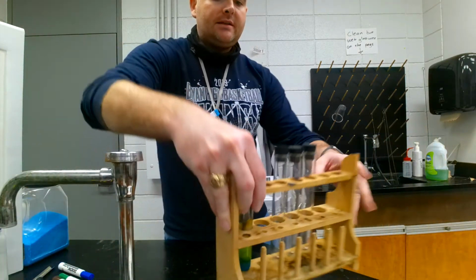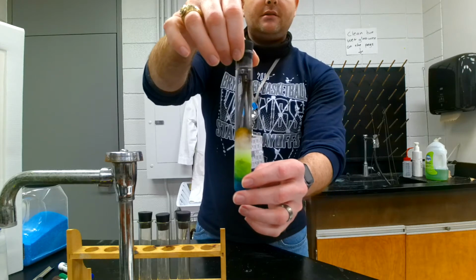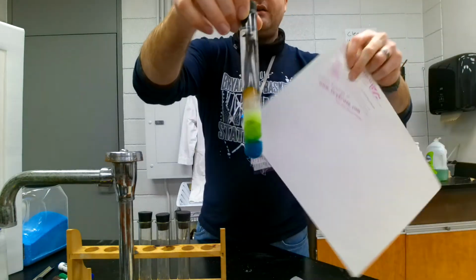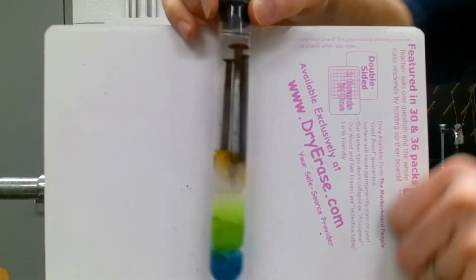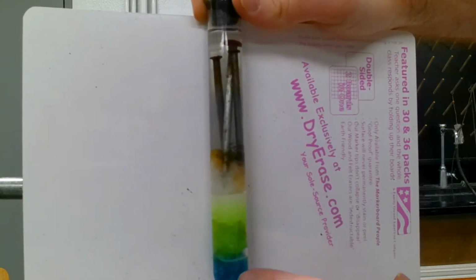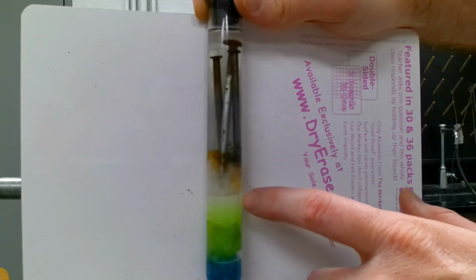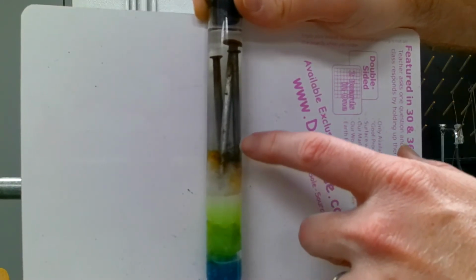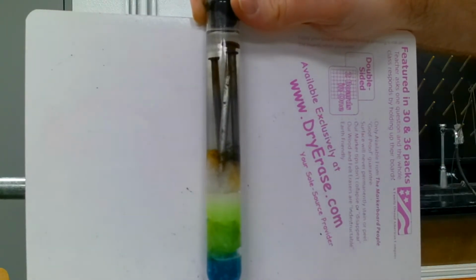Okay, I'm here to show you the results for the experiment, and if you will take a look, we have this right here, and it looks pretty cool. Let's see if I can get a background on that. And as you can tell, you will see that the bottom part still stays blue. And this part is kind of green. You still have kind of the white electrolyte. Now the iron nails have kind of poked through this cotton. I think that's mostly due to gravity here.